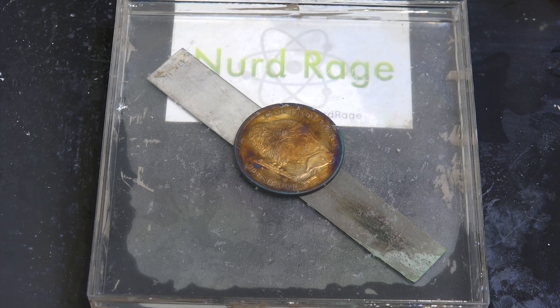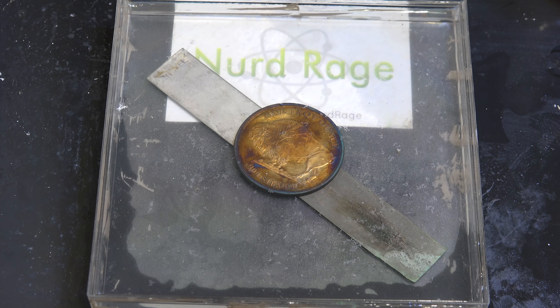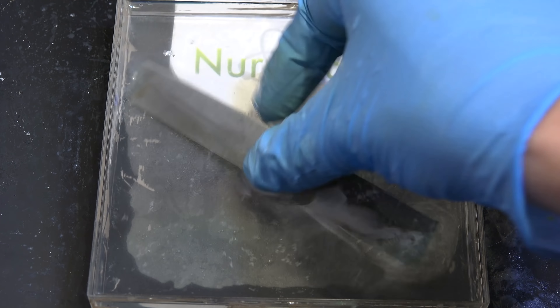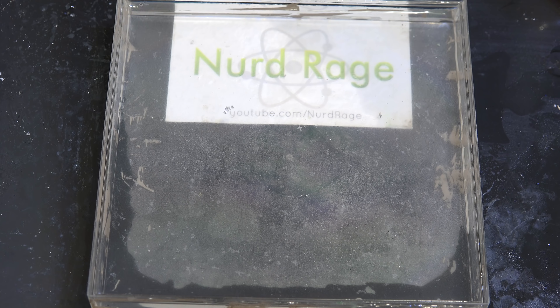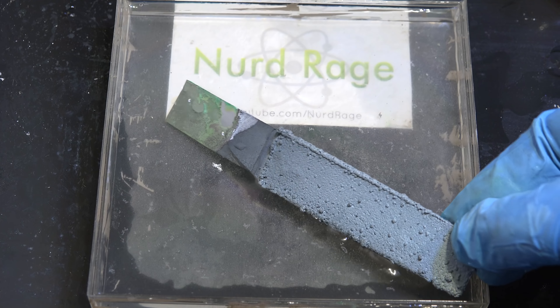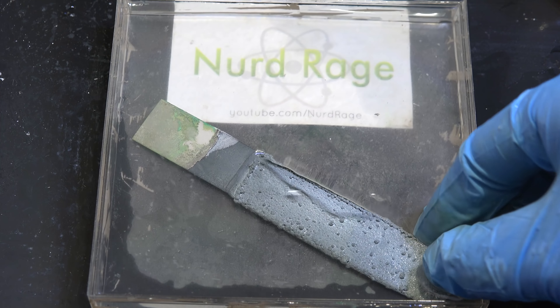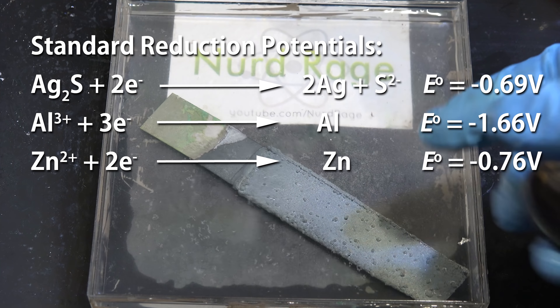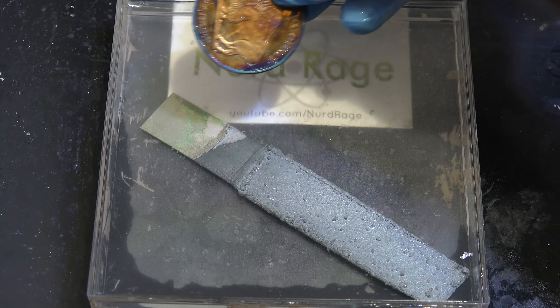Now you might be asking what would happen if we tried a metal other than aluminum. Let me try again, this time using nickel metal. Nickel has a much higher reduction potential than aluminum — in fact it's even higher than silver sulfide — so as you can see, nothing happens. The oxidation of nickel just isn't strong enough to force the reduction of silver sulfide.